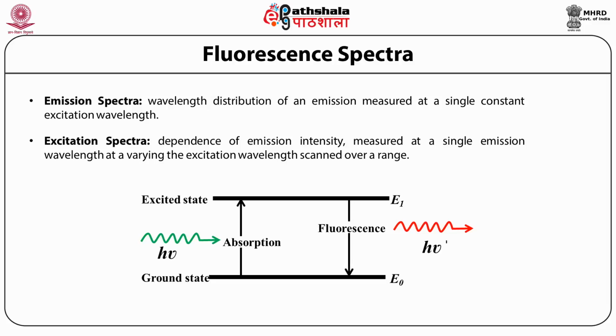The excitation spectrum is the dependence of emission intensity measured at a single emission wavelength by varying the excitation wavelength scanned over a range. This would represent the relative emission of the fluorophore at each excitation wavelength.